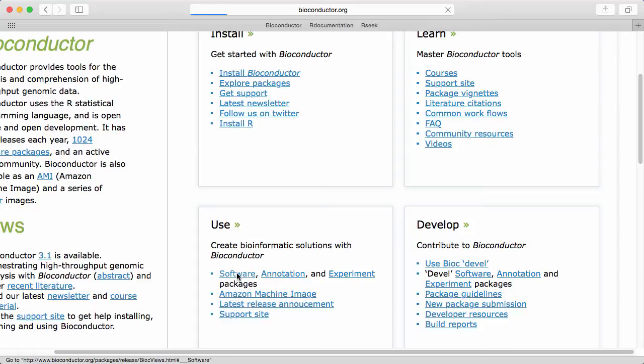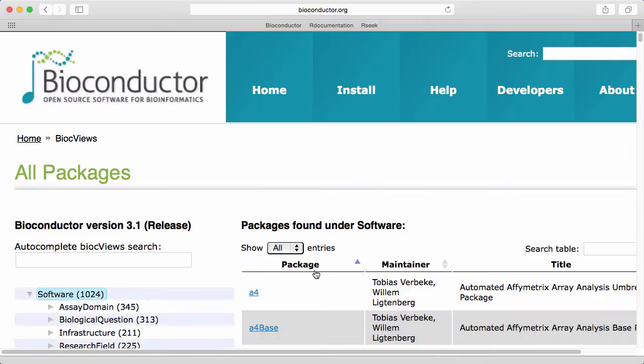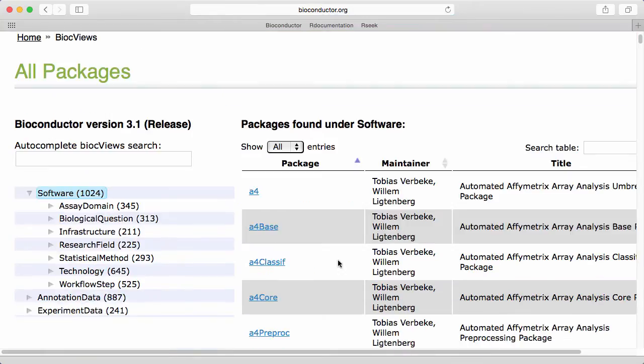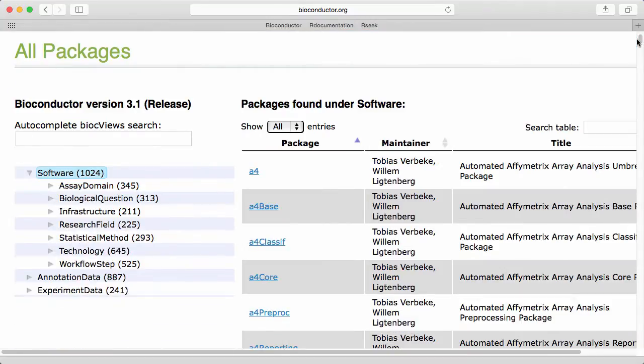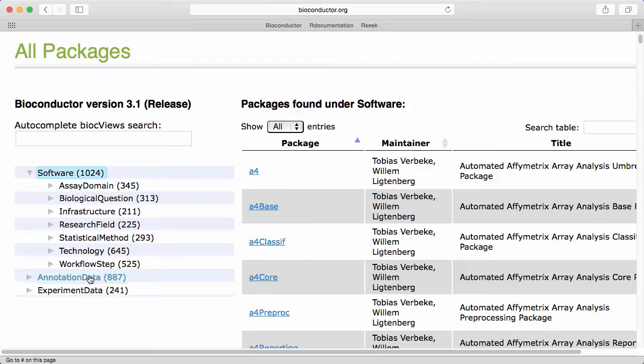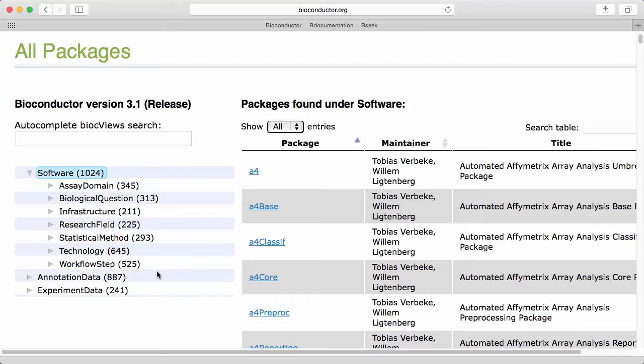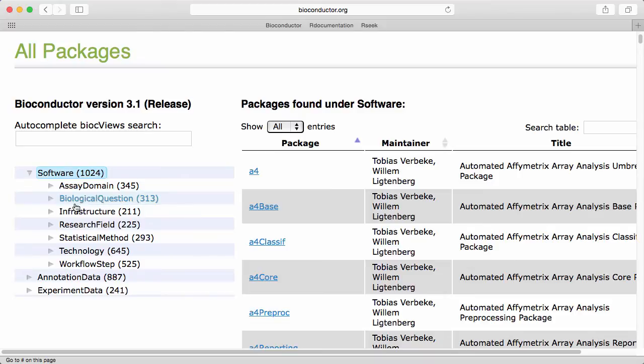So let's click on the software tab and here we get a list of all the Bioconductor packages in the current release. Out to the left here we have a number of keywords. These are called Bioconductor views and they are keywords that package authors use to check the different packages. The intention is that this will allow you to easily find packages of interest for a specific statistical method or biological question.